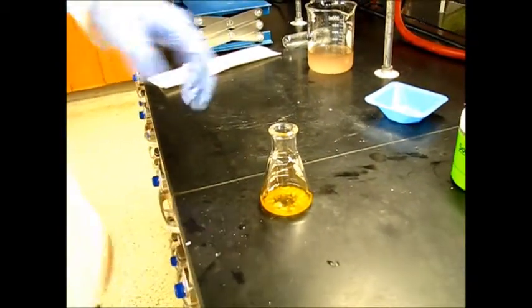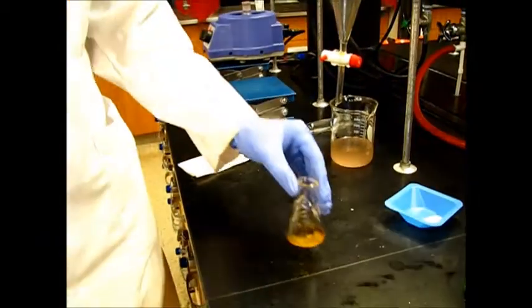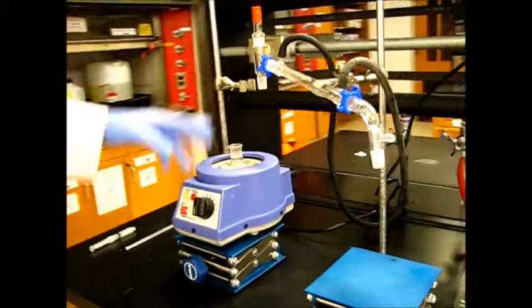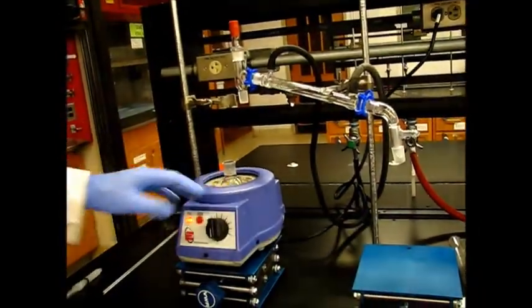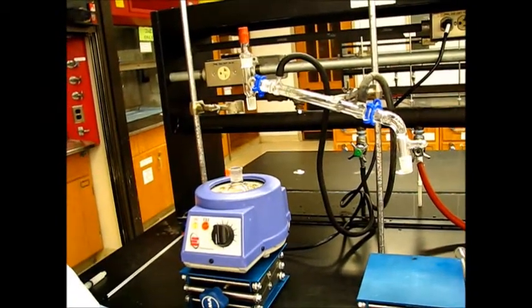So now we're going to decant this into our round bottom flask and then set up the simple distillation. What we'll distill out will be our product, so we'll collect our product over here, and what will be remaining in the round bottom flask is any remaining acetic acid or sulfuric acid.